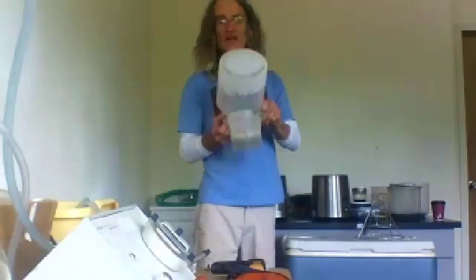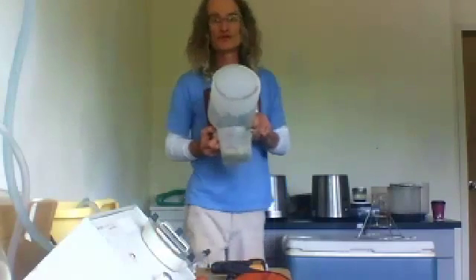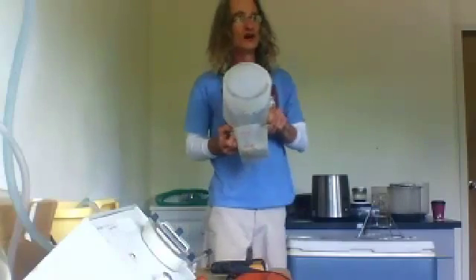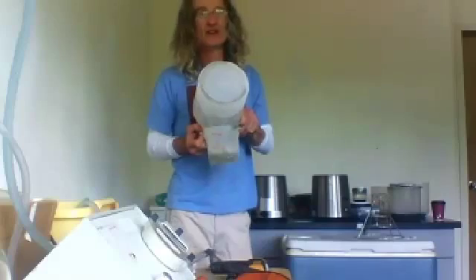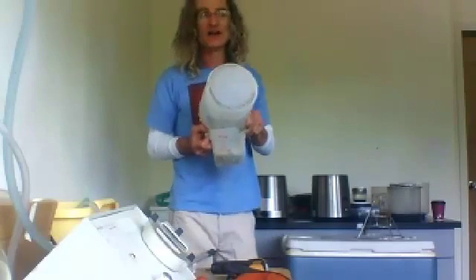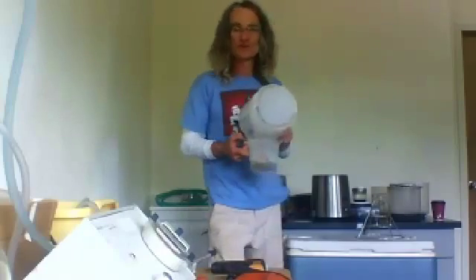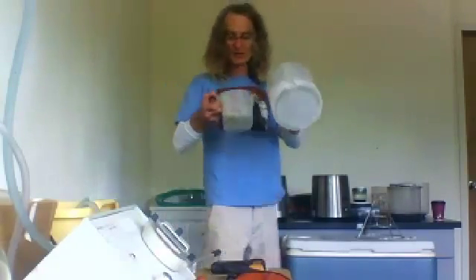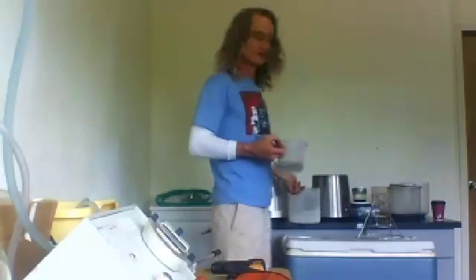The only way you're going to get that back is by sticking it in a centrifuge under cold temperatures to remove the rest of the alcohol, or doing a heat exchange and recondensing that vapor, recondensing the alcohol that way. You've got a choice of not losing. But there we go. We've got half of it back, and half is still in there because it's still going through the filter. So there you have it, guys.